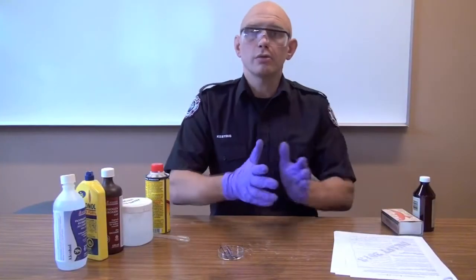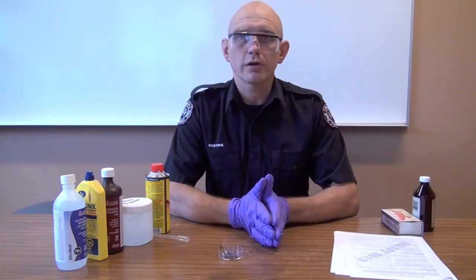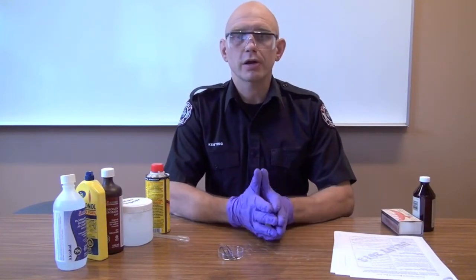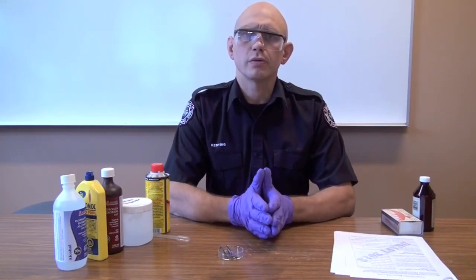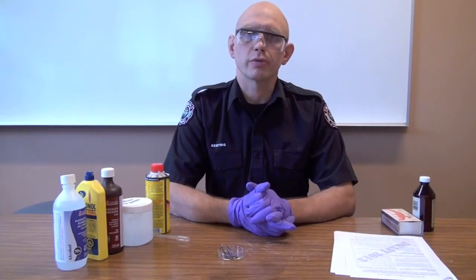Depending on whether this is enough information for you or not, you can either stop the entire exercise here, or you can continue on to the pull tube checklist, which is step five of the unknown liquids protocol.